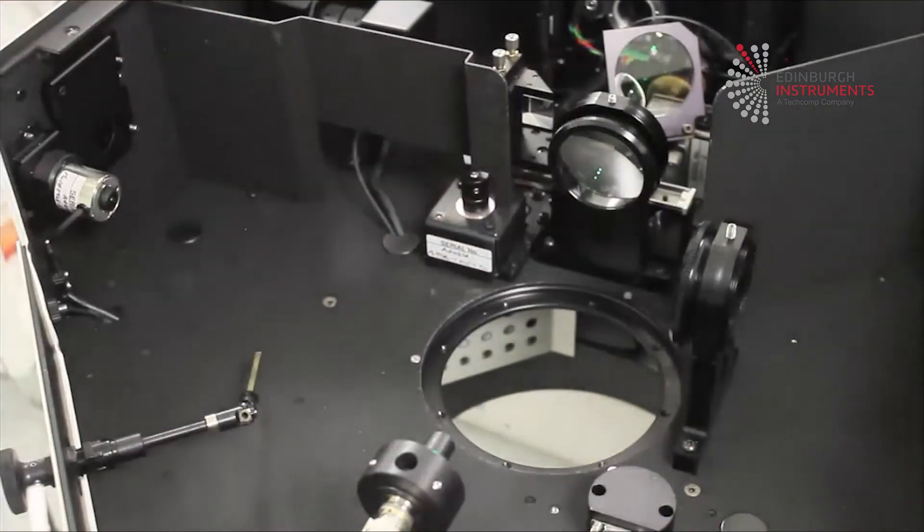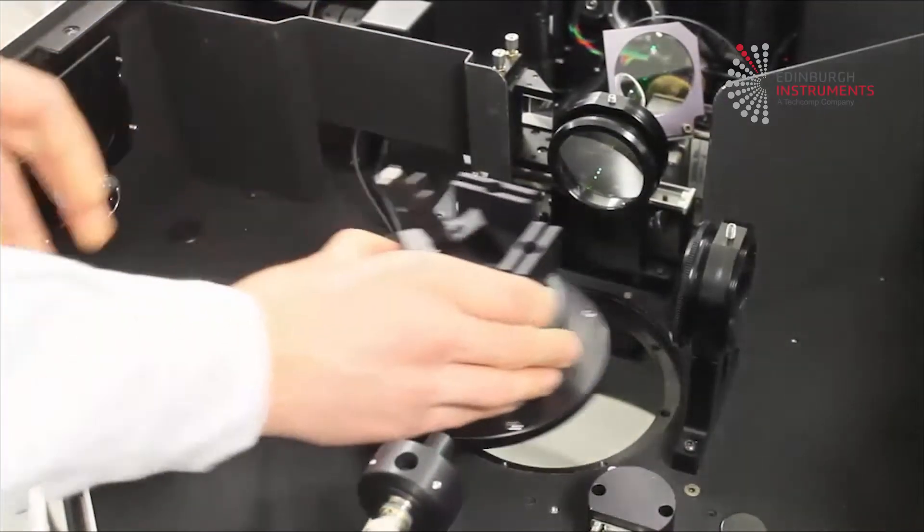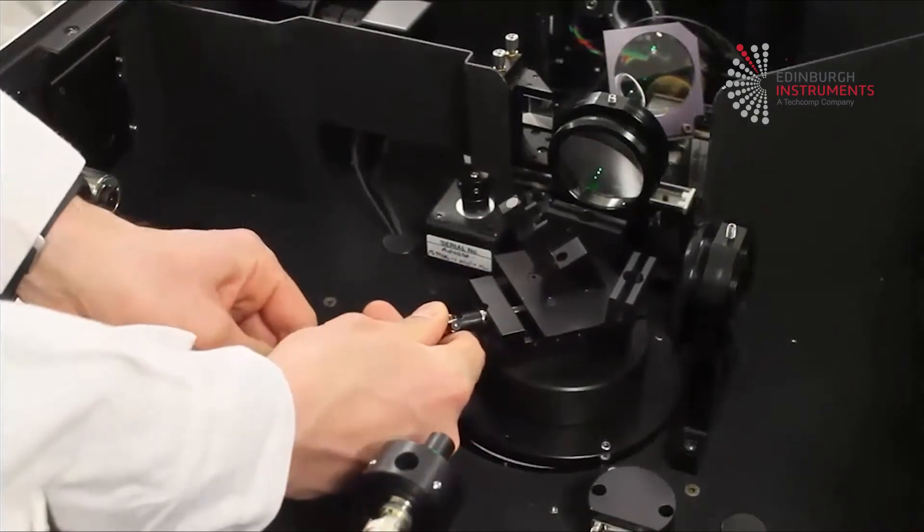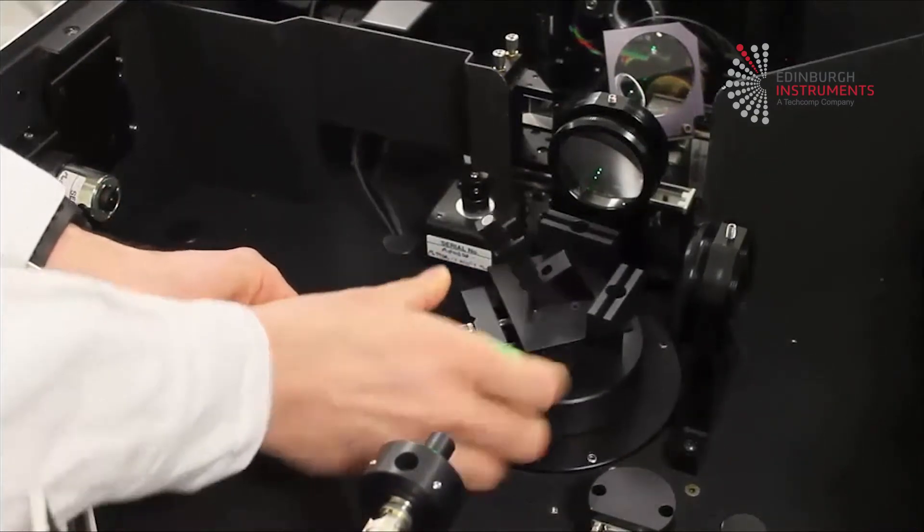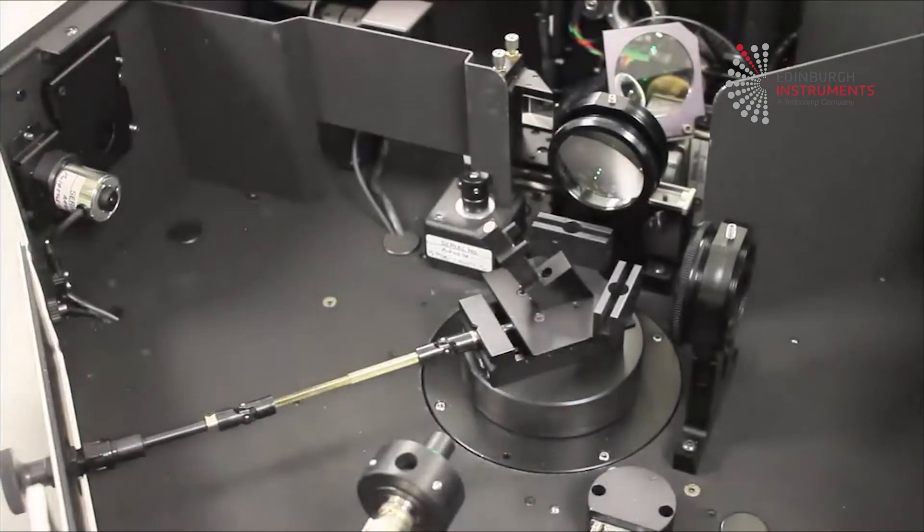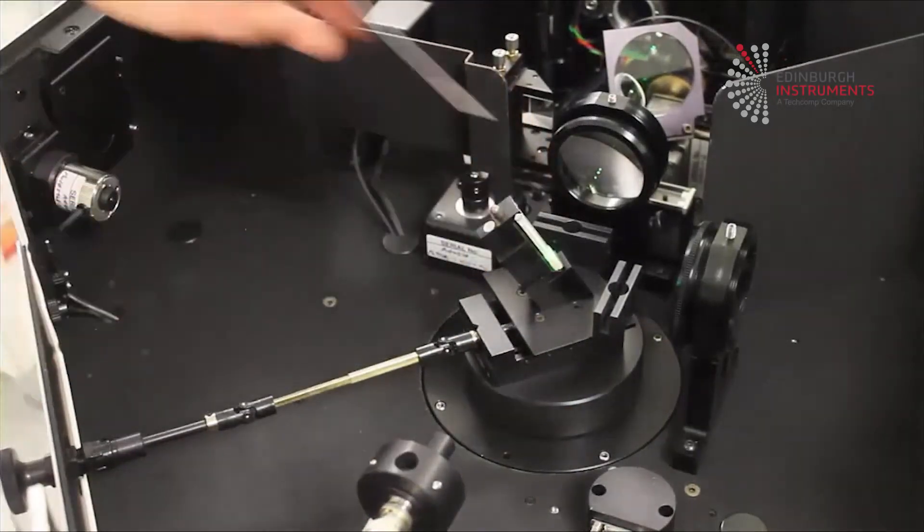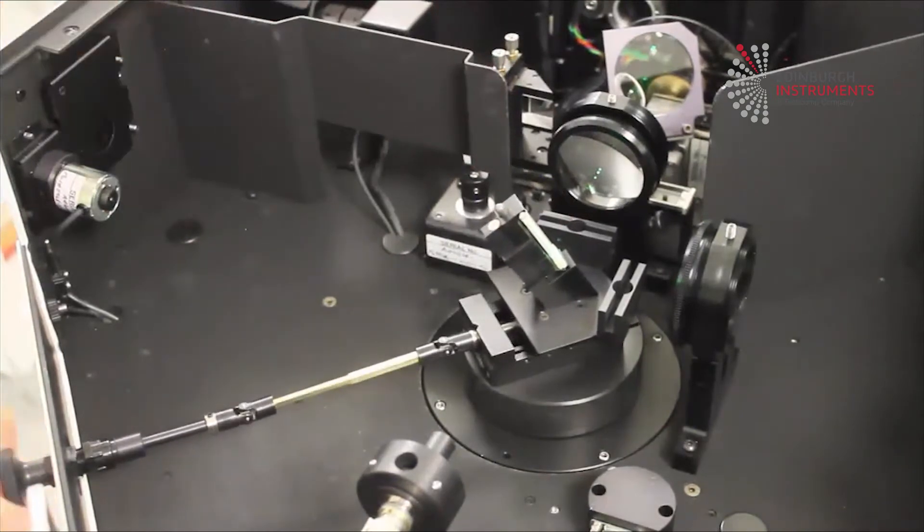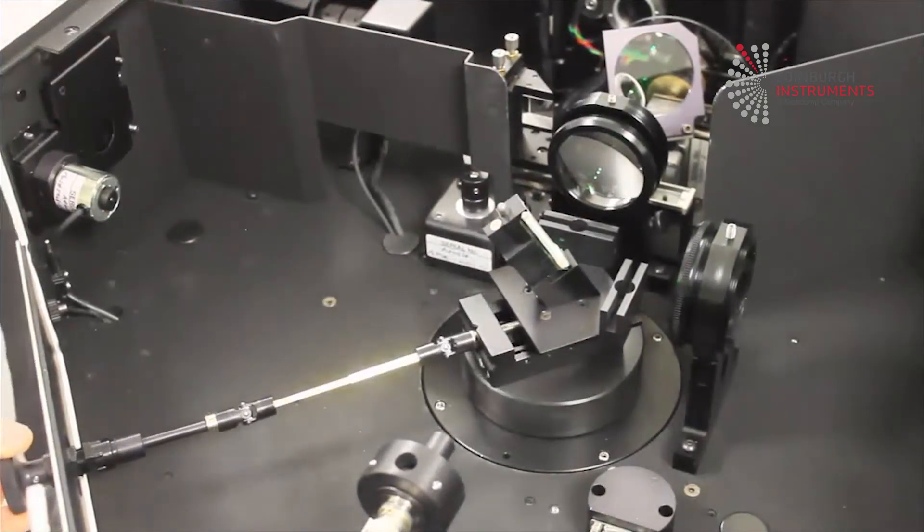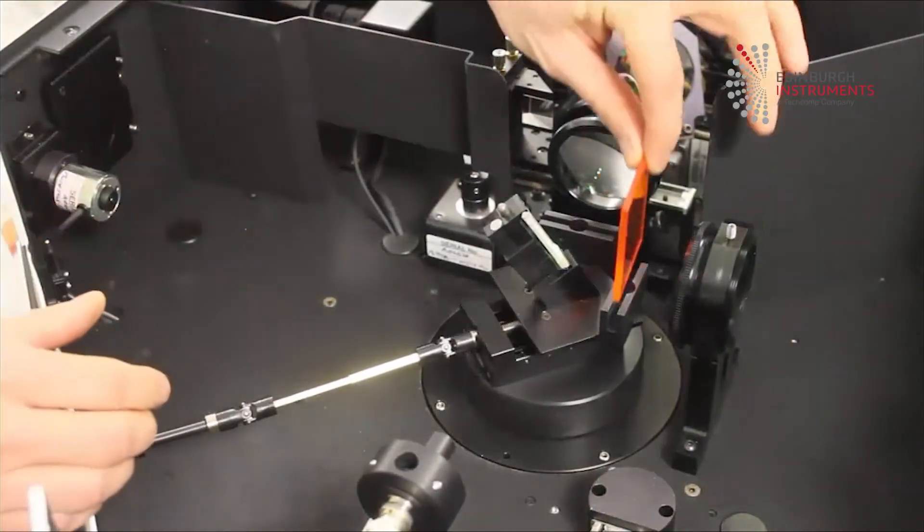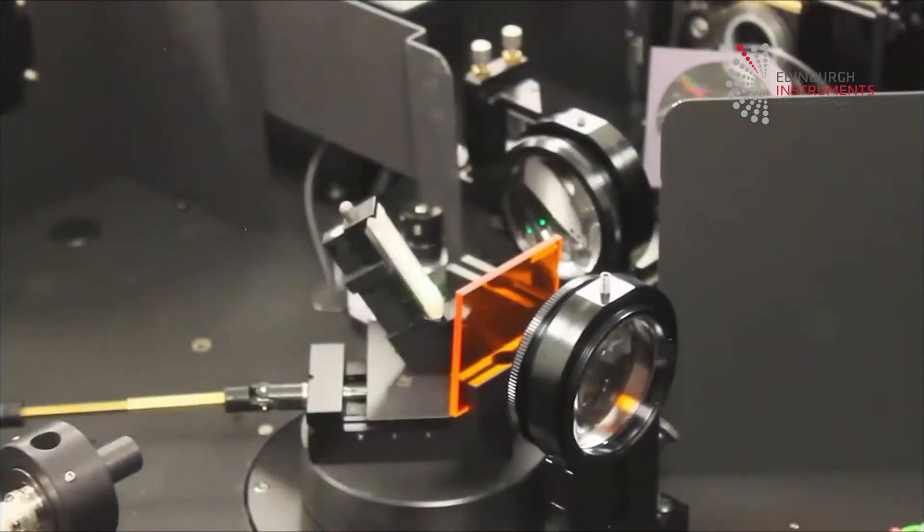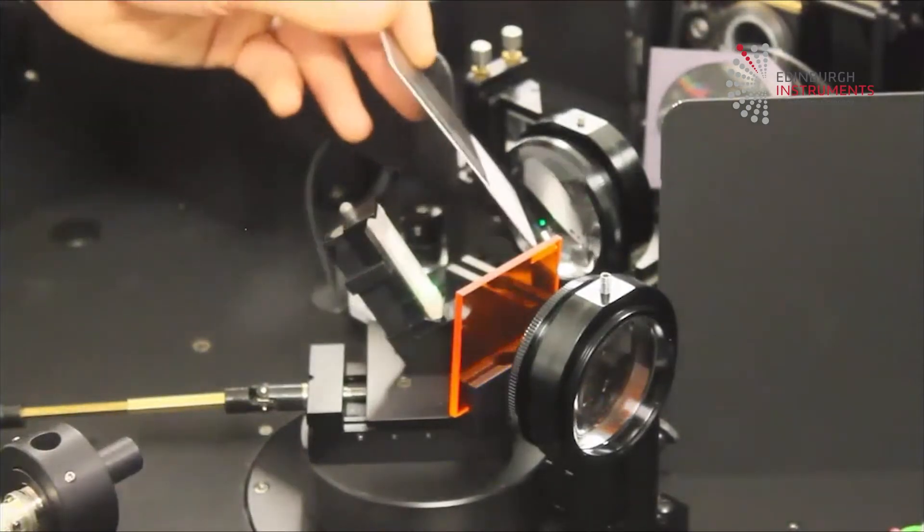Start by placing the front face sample holder or SC-10 into your system. For the FLS and LifeSpec 2, the positioning rod parts need to be fitted carefully. Note the sample holder is reclined to prevent a direct specular reflection of the excitation beam into the emission monochromator.